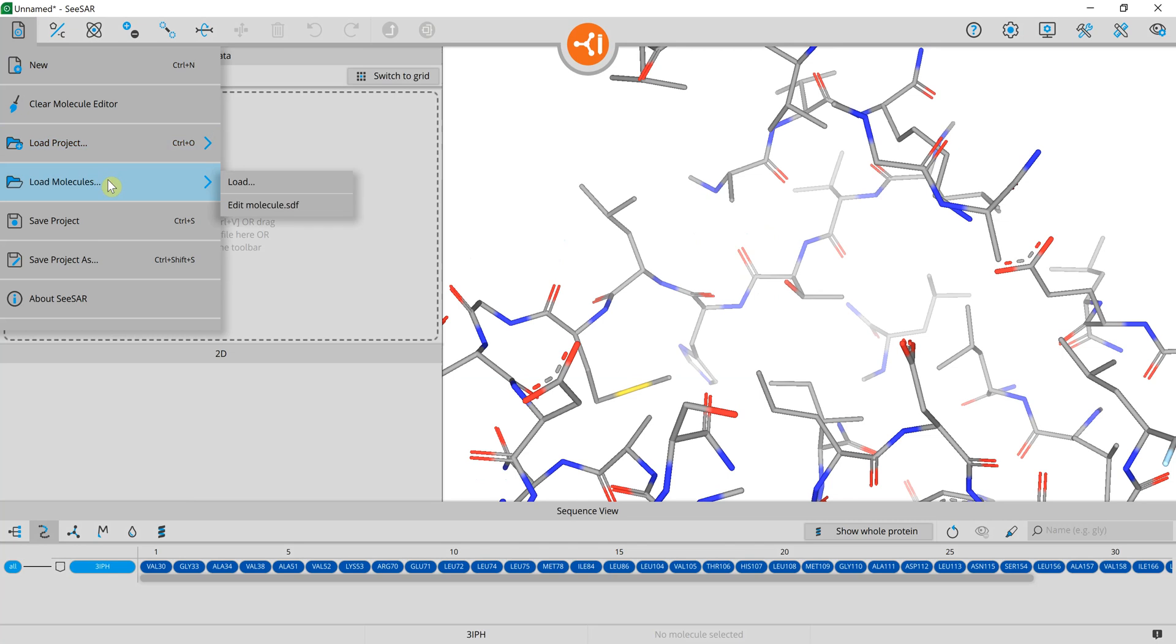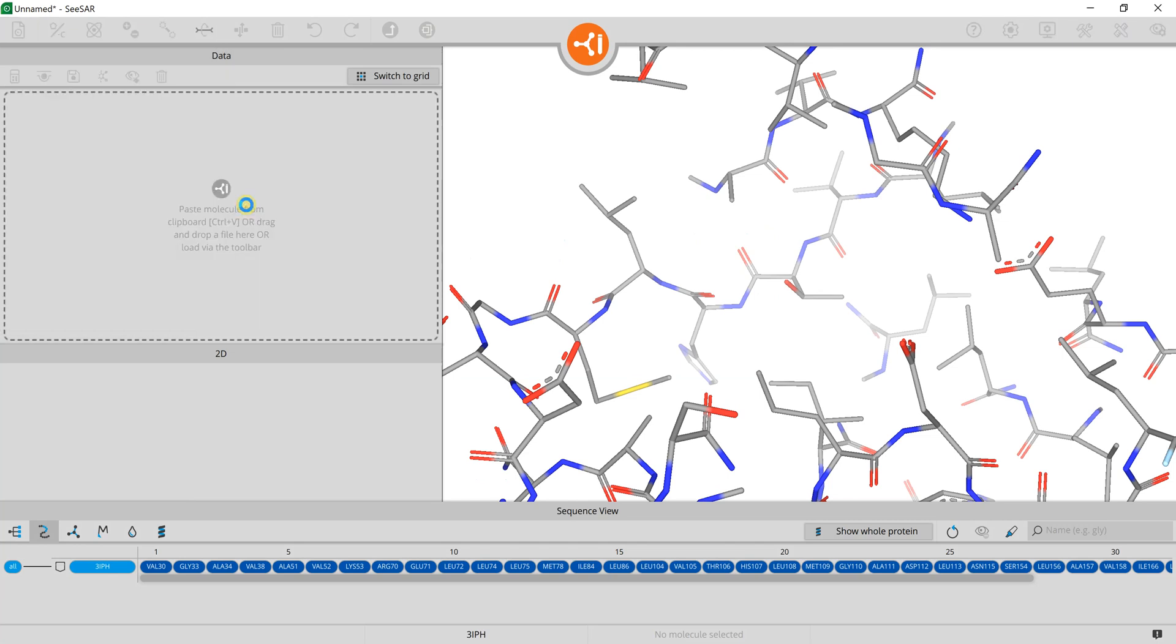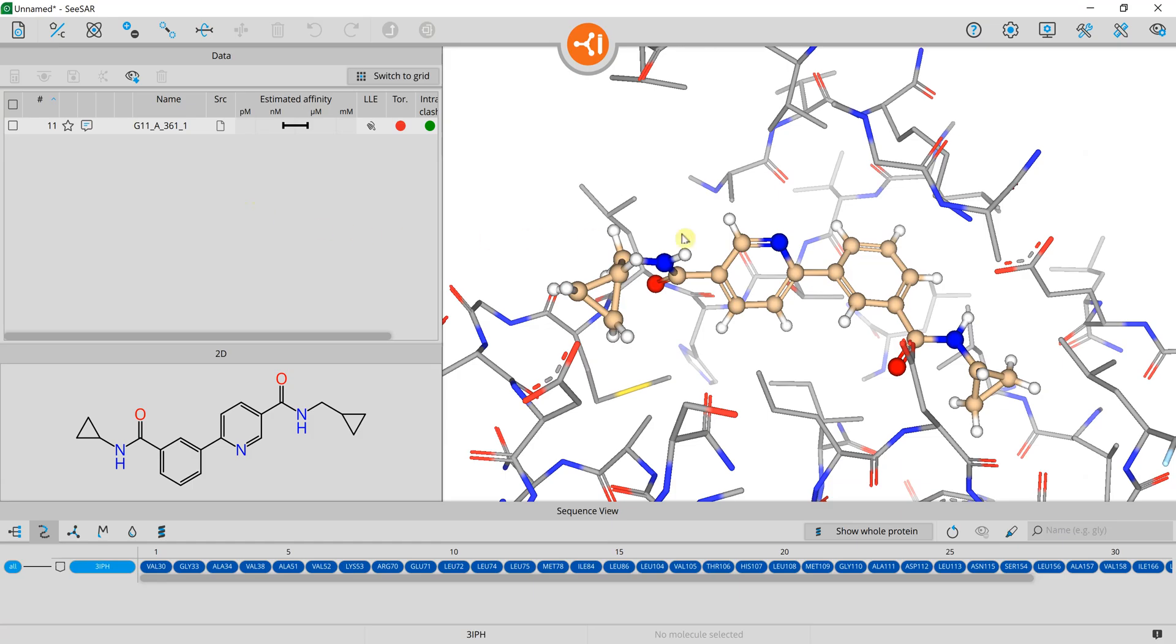We load a ligand from a file into the editor mode and inspect where around the ligand there is space to grow into.